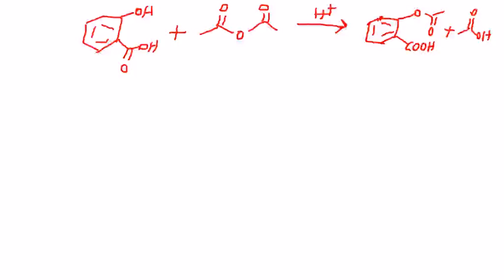Alright, the lab for this week, which happens to be the last lab, is the synthesis of aspirin. We are going to begin with salicylic acid, which is a carboxylic acid. And so if you were to provide a name for that, you can perhaps envision this is going to be orthohydroxybenzoic acid, the IUPAC name for that.